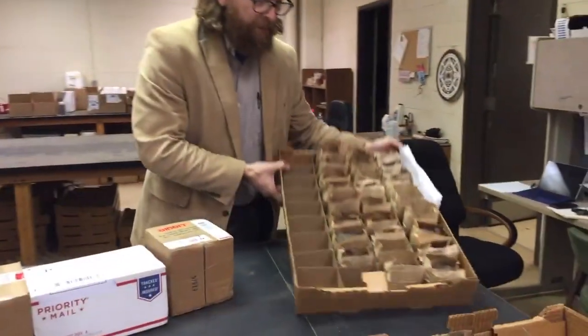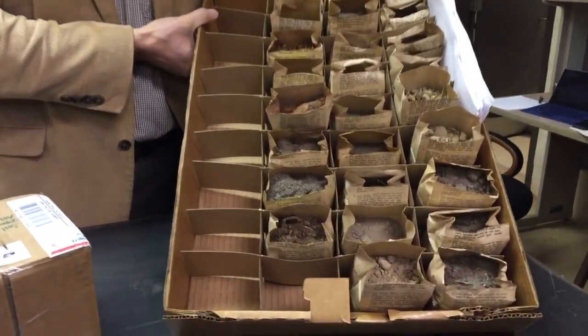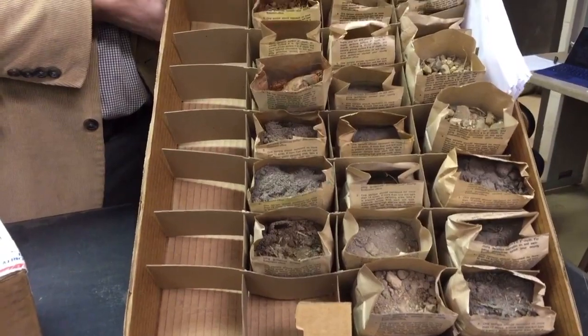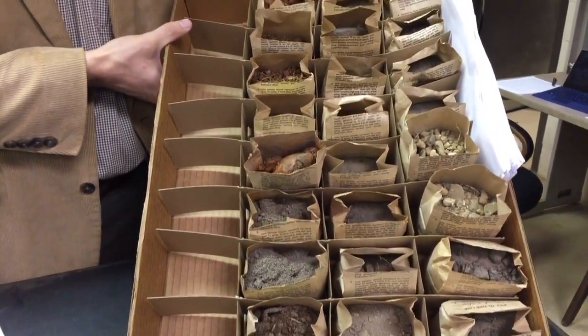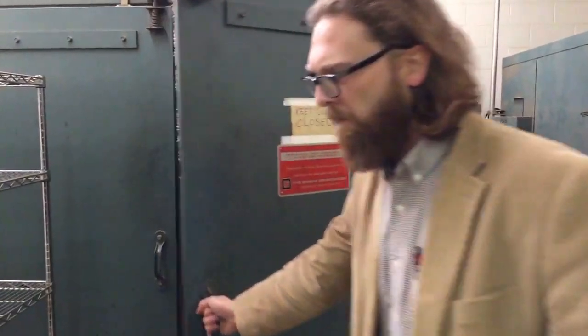So every day we get the soil samples, we get them sorted in set boxes here. This is how we start the tracking process so we can keep everyone's samples in order. First, the soil samples are dried in large ovens for 24 hours.